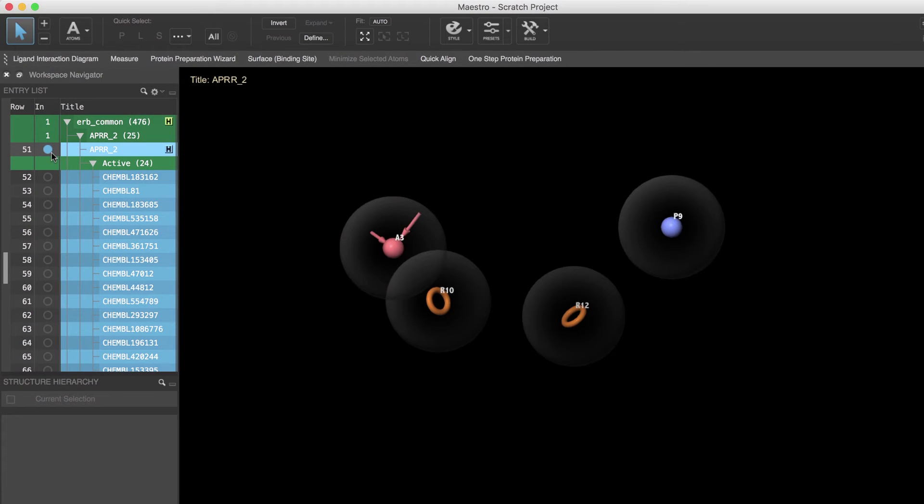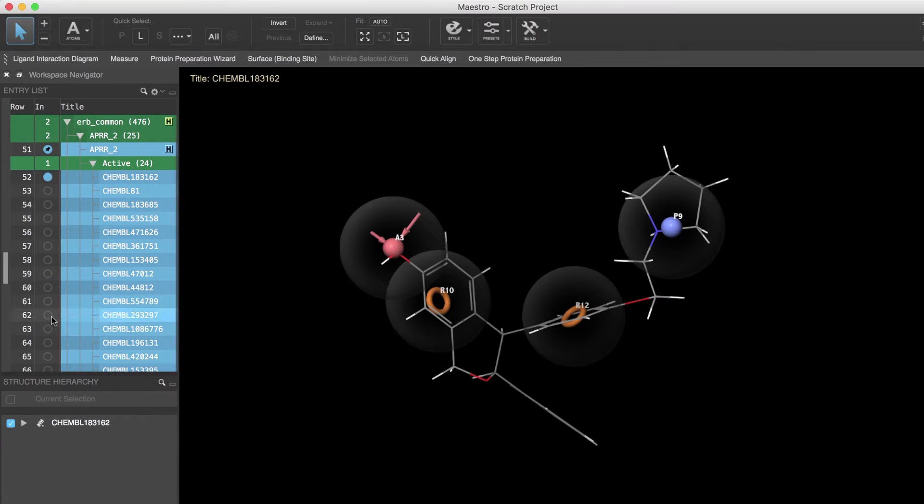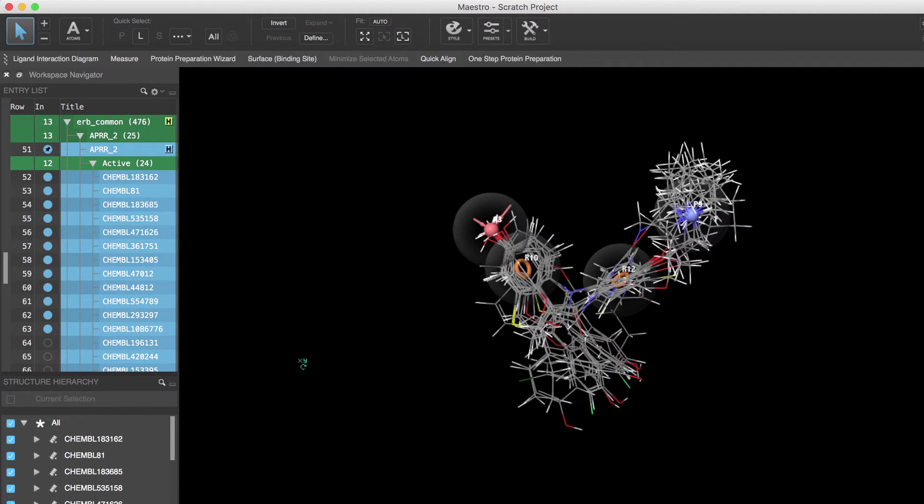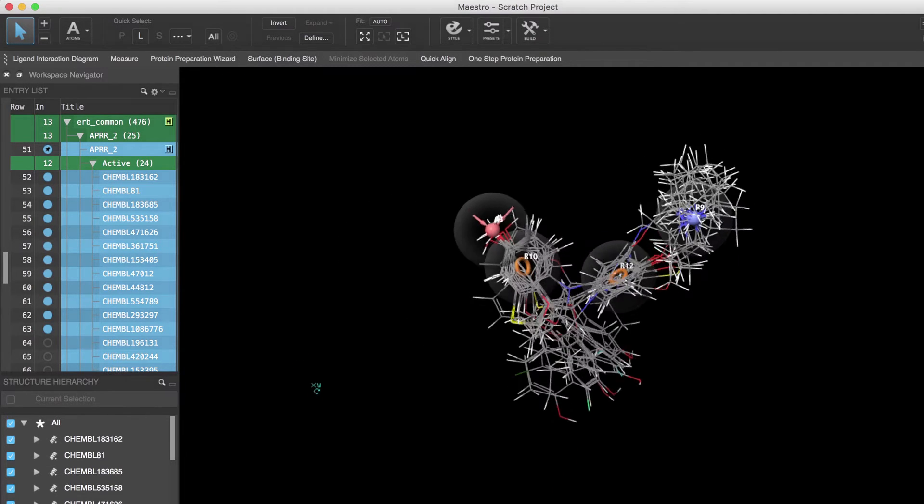In this video exercise we will create common pharmacophore hypotheses from a diverse set of known estrogen receptor ligands as found in the phase tutorial. So let's begin.